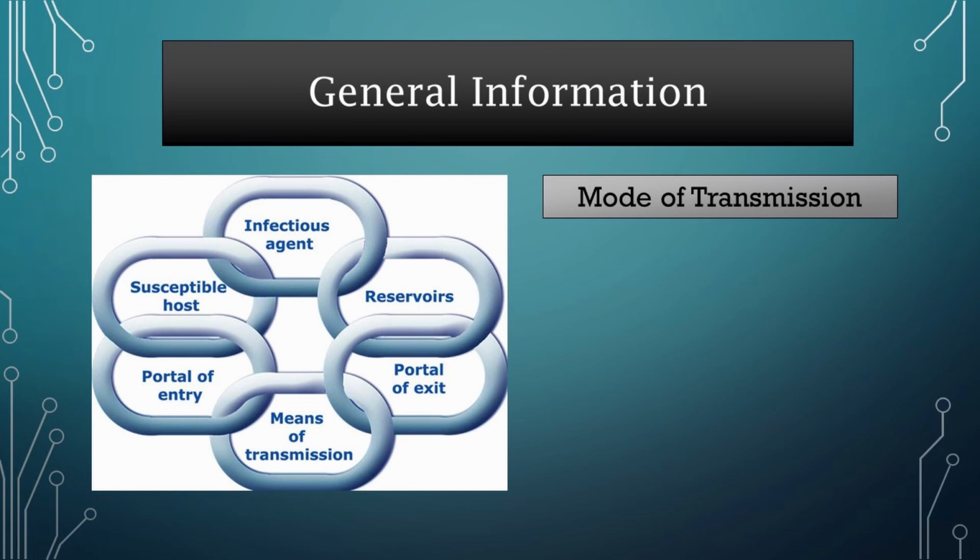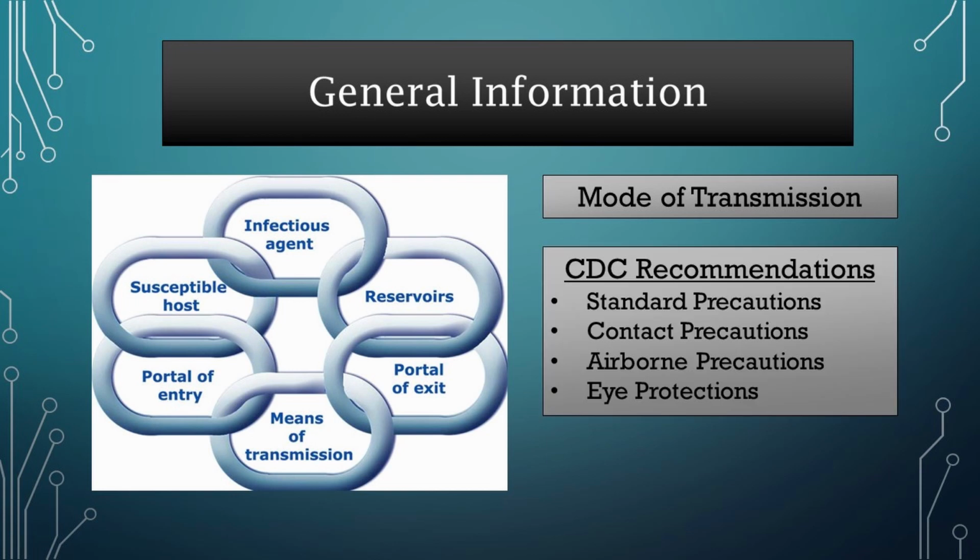In the chain of infection, the mode of transmission is the means by which the pathogen travels to a new host. For COVID-19, the CDC recommends standard precaution, contact precaution, airborne precaution, and eye protection.